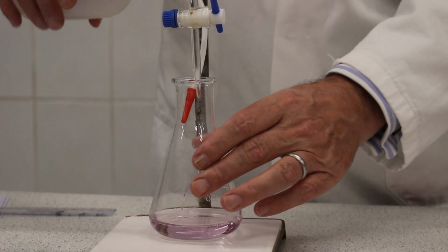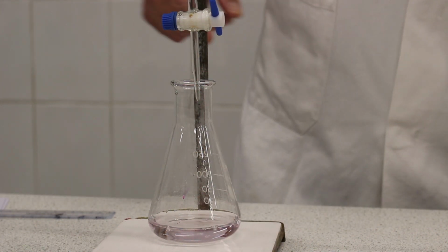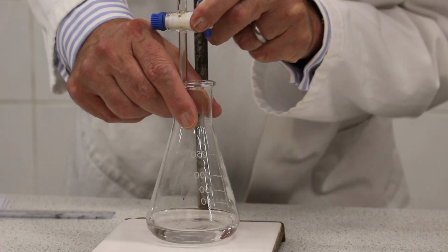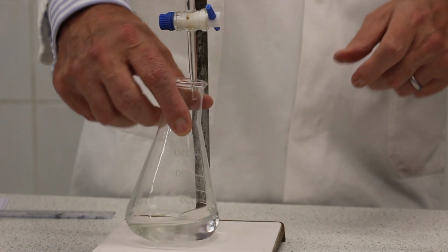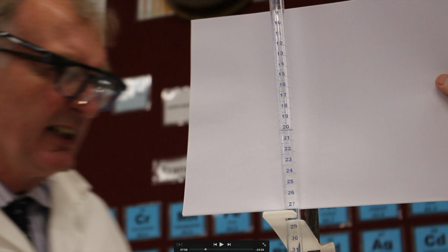Now Mr. Firth is making sure here, by using some deionised water, that the acid and alkali is actually in the conical flask and not on the sides of the flask. He's rinsing it with some water. And he's just added one more drop just to make sure that he's ended up with his colourless solution and he's reached the end point. Now all Mr. Firth will then do is note the final reading.